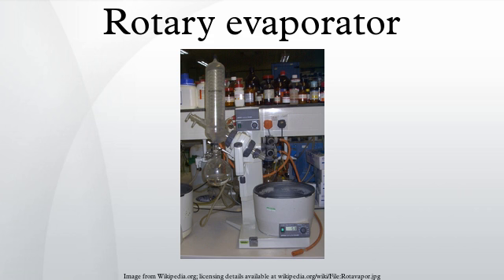The modern centrifugal evaporation technologies are particularly useful when one has many samples to do in parallel, as in medium to high throughput synthesis now expanding in industry and academia. Evaporation under vacuum can also, in principle, be performed using standard organic distillation glassware, that is, without rotation of the sample.